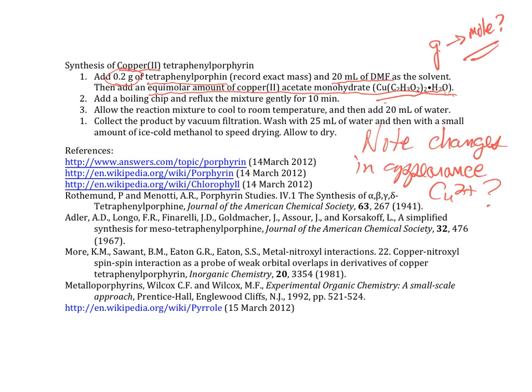So there are lots of good observations in this lab for us to write down. We've got a couple of different processes we're doing. We're doing a standard reflux in this part. We're doing the modified reflux as we're creating our tetraphenylporphin. If you have any questions, please let me know. This is in place of your normal lab introduction.